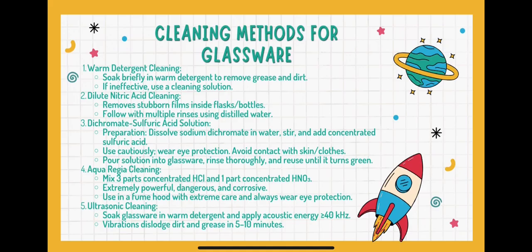Second is dilute nitric acid cleaning. For tougher stains inside a flask or bottle, use dilute nitric acid. Don't forget to rinse it several times with distilled water afterward.